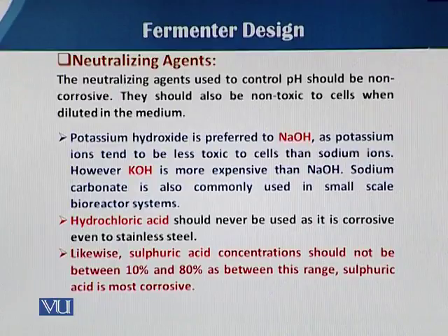As for the agents which can be utilized as neutralizing agents, they should be non-corrosive. In the case of hydrochloric acid, if the vessel is stainless steel, we cannot use any chlorinated compound, or compounds which have chloride in them. So we cannot use such compounds.